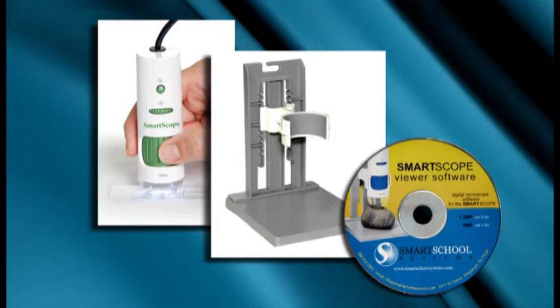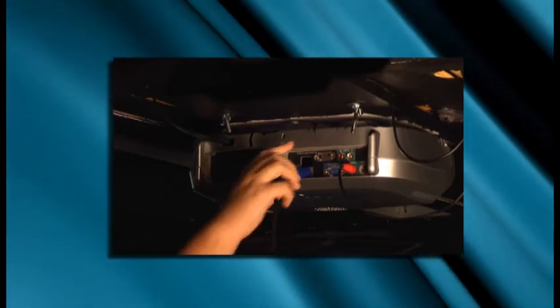The software is compatible with both PCs and Macs, and the SmartScope works great with interactive whiteboards.